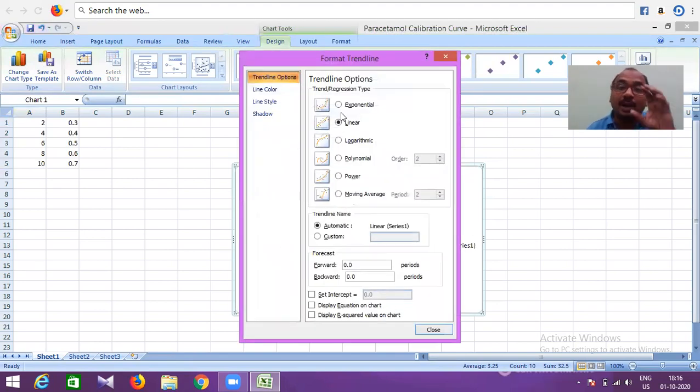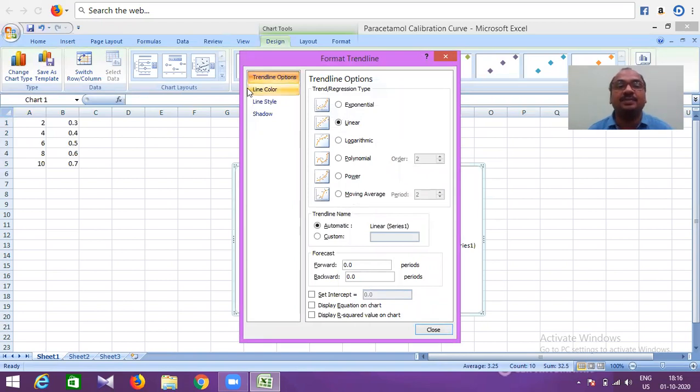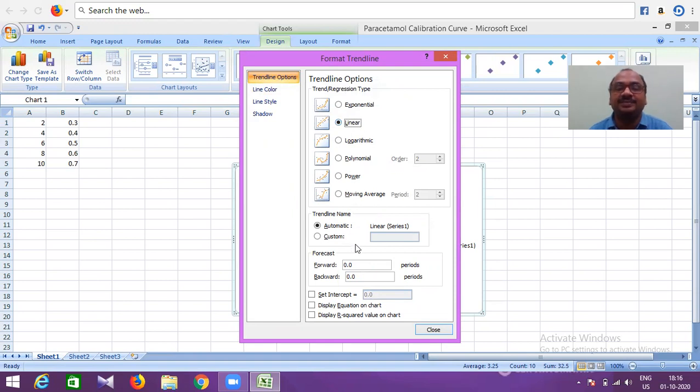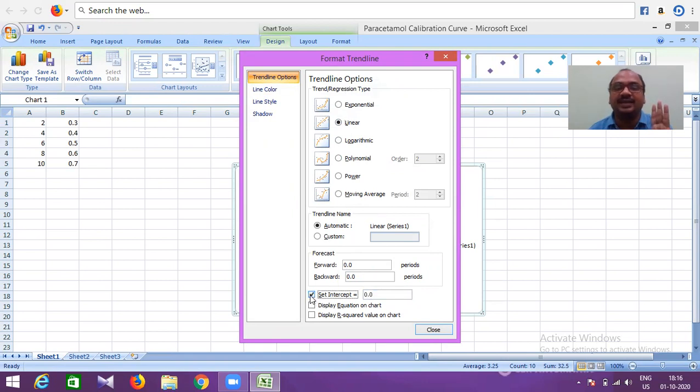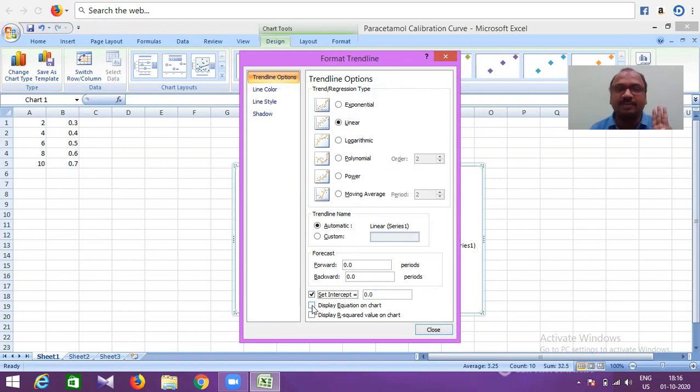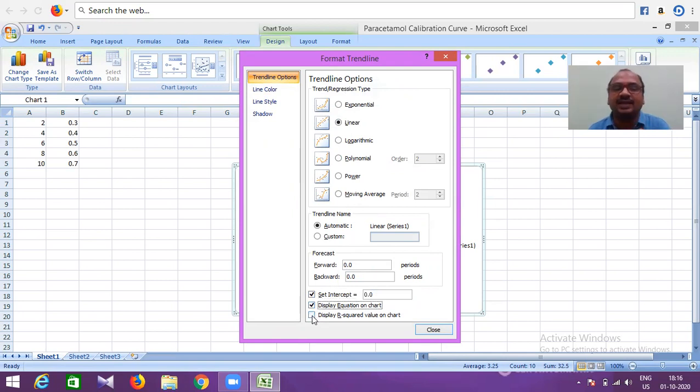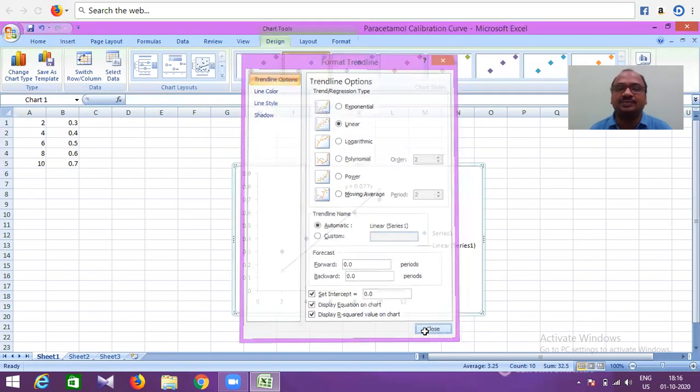A popup will open. In that popup, select linear. At the bottom, three important options: set intercept to 0—you can do this, no problem, it's not compulsory but acceptable. Display equation on chart, and display R-square value on chart. Now close it.